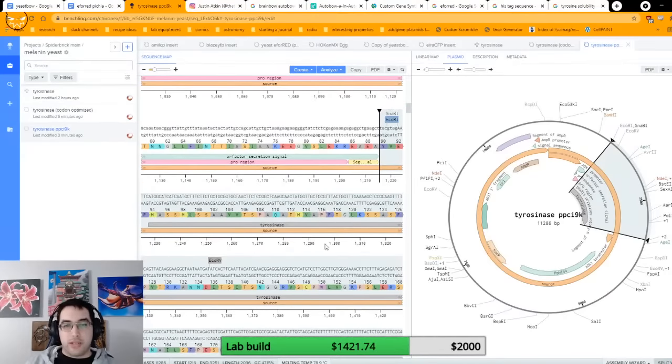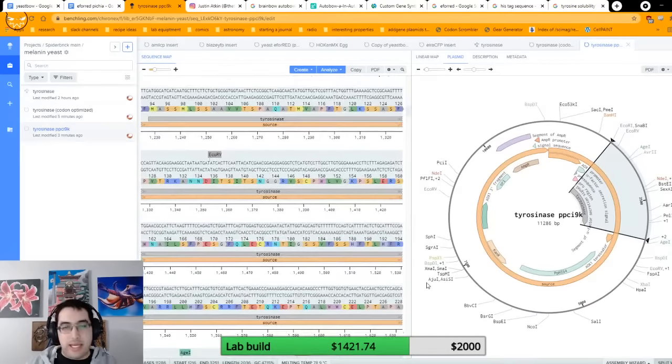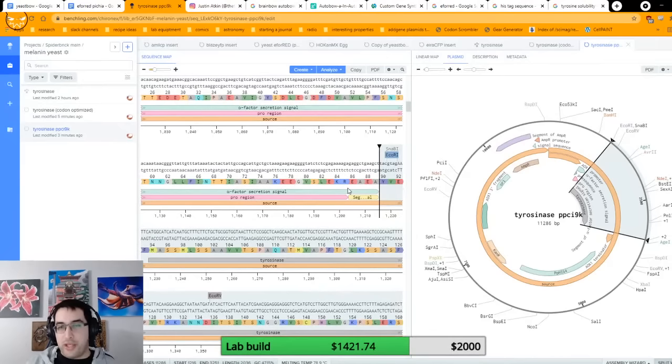Cool, so now we've got tyrosinase. So now, in theory, if I order this, I should be able to put it into yeast, and the yeast should just crank out melanin. Don't know why that's useful, but it might be. The one nice thing with this is I should be able to cut this out at any point. Once I know that this works, I should be able to cut out the whole thing, stick it into a backbone for a food safe yeast, and then make a black beer. A naturally black beer.